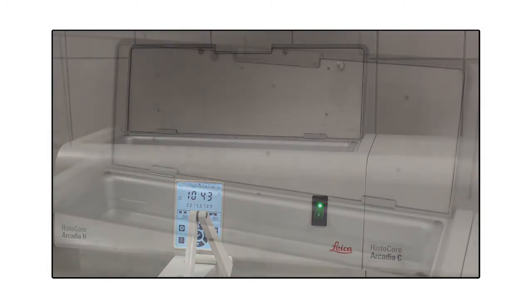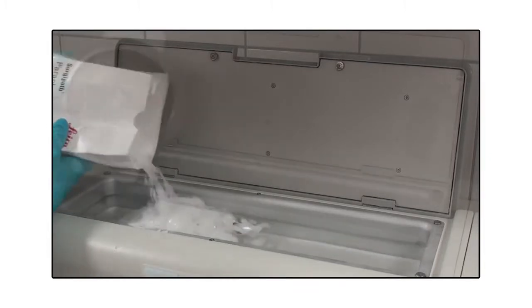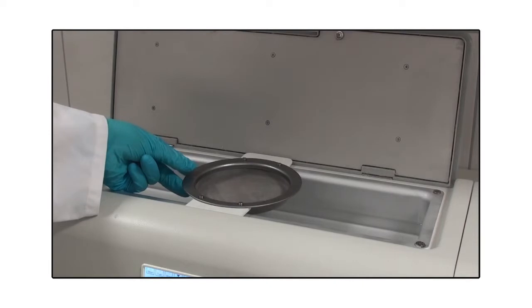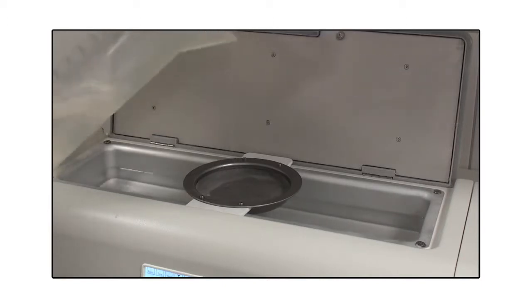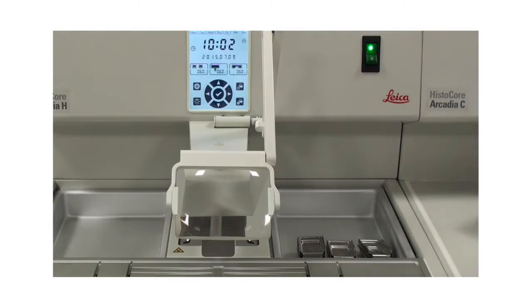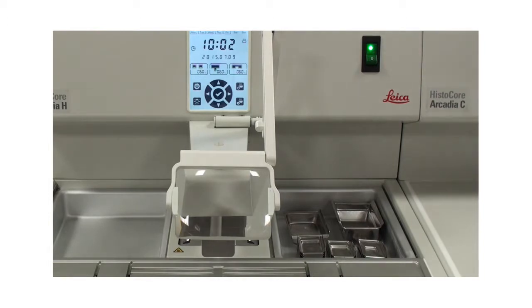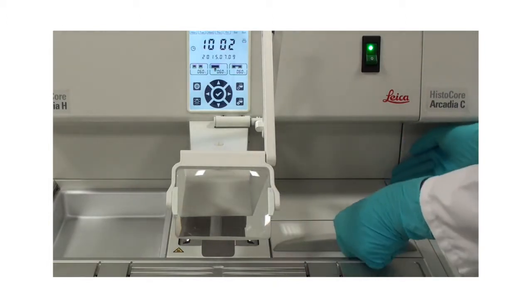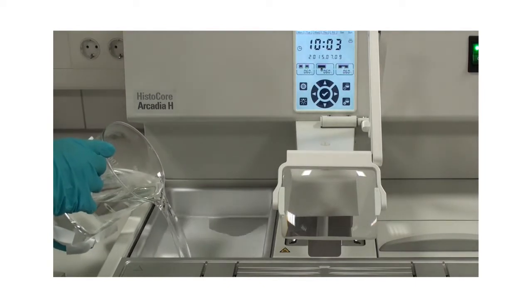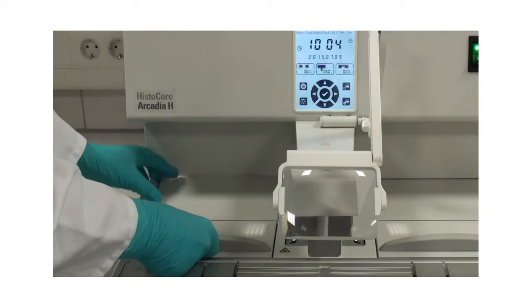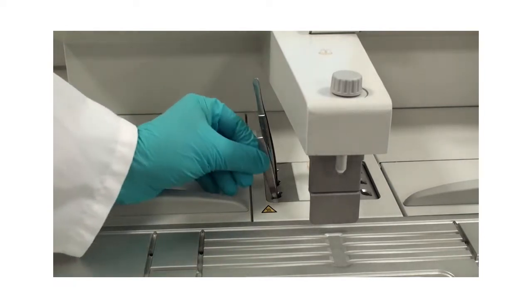Fill the paraffin tank with either paraffin pellets or with liquid paraffin. Insert standard molds or mega molds. Fill the cassette tray with liquid paraffin. Cassette and mold trays can be stored according to your preferred working direction. Add forceps and you are ready to set up your working parameters and start embedding specimens.